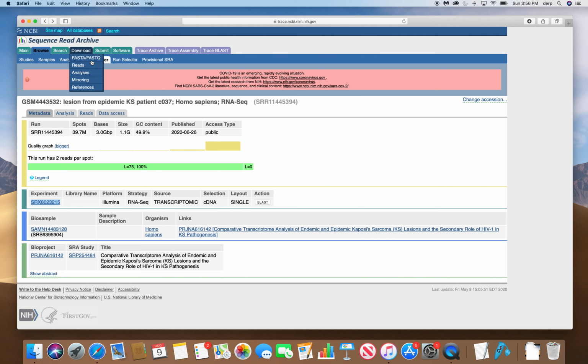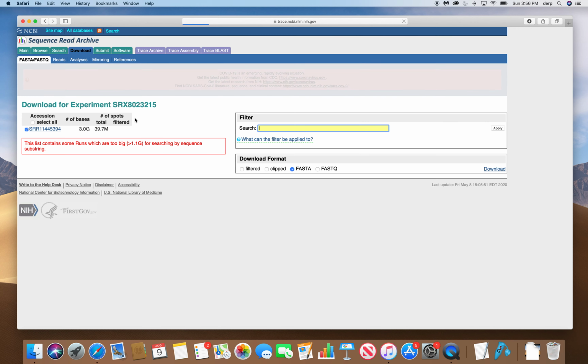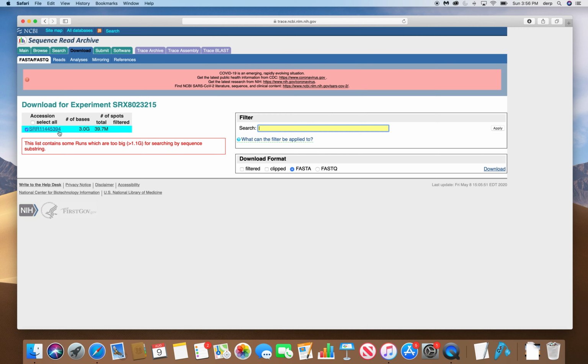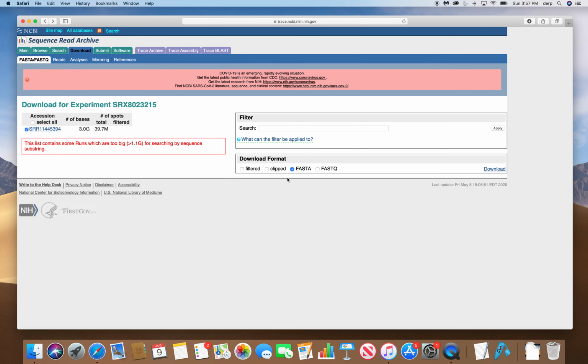There are reasons why they subdivide this, because of things that I'm not super sure of, just to make our lives less easy, right? Anyways, let's try this accession number. And then, okay, this gives us something. So we can click that. No, I don't want to do that. Okay, yes. So this is selected from this experiment, and this just gives us our confirmation. This was the number that we were looking at before. It gives us some different download options.